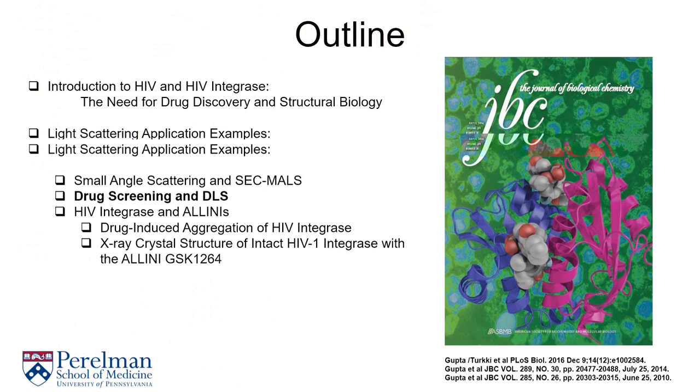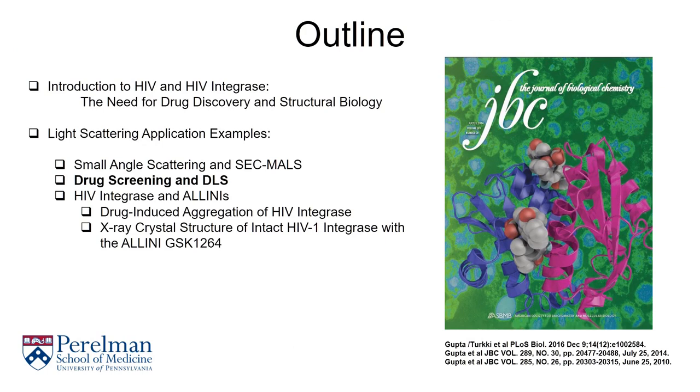Okay, now I've told you about small-angle scattering. Next, I'm going to tell you about dynamic light scattering and how the techniques have helped us evaluate and assess lead compounds that bind to HIV integrase.